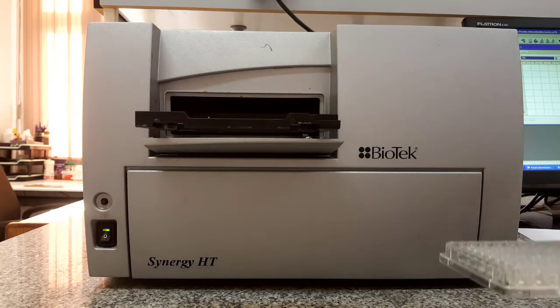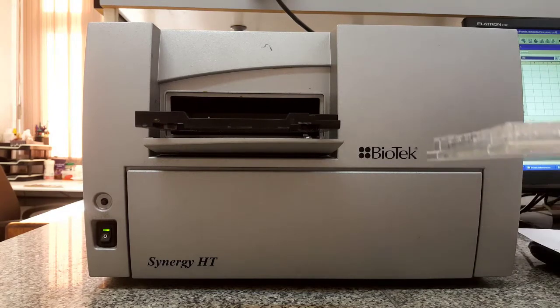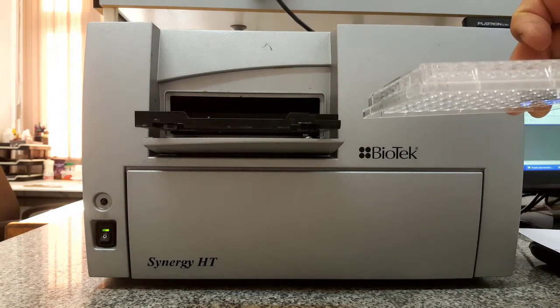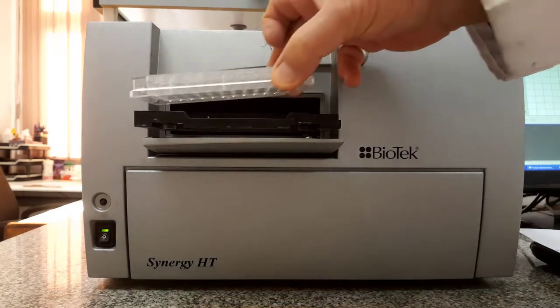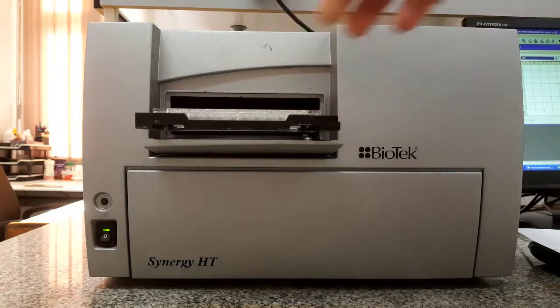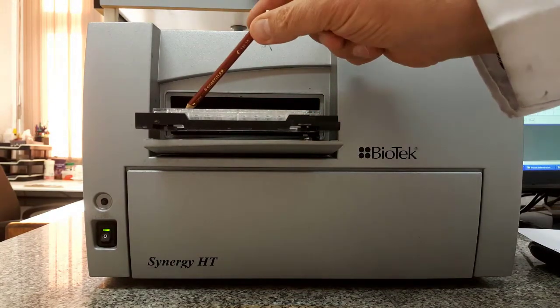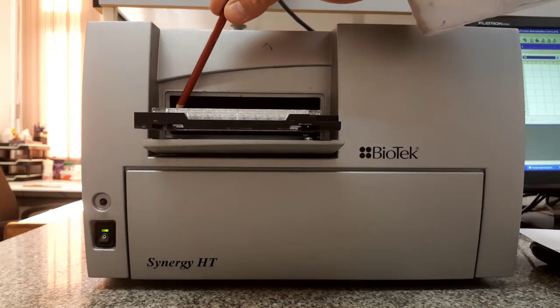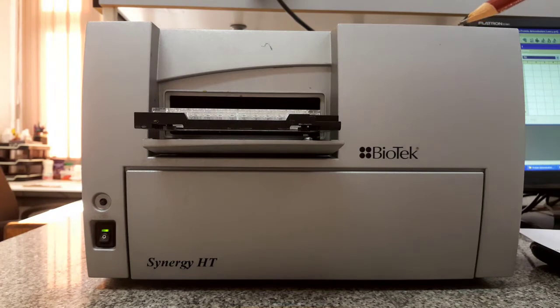Place 96 well plate in the plate carrier of the microplate reader so that the well A1 is in the left rear corner of the carrier. Please pay attention to letter A1 in the left rear corner of the carrier of instrument. Actually, well A1 in the 96 well plate should be beside letter A1 in the left rear corner of the carrier of instrument.